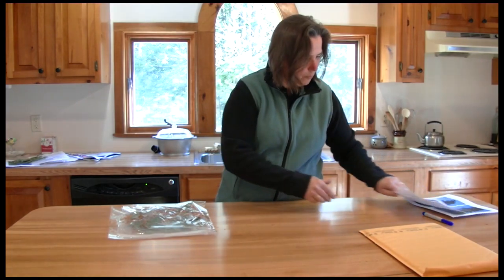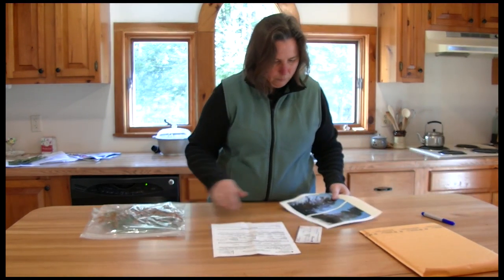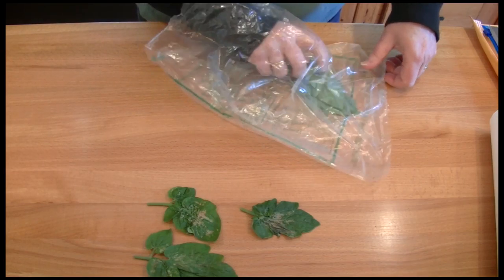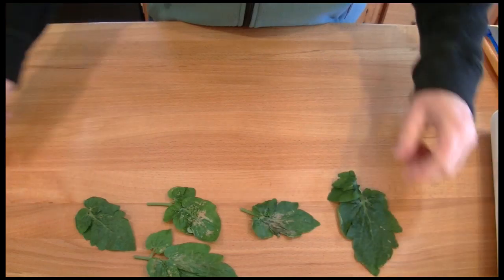When submitting samples to the Plant Diagnostic Lab, first collect your samples and have all the materials ready to package and ship the samples. Be sure to have a completed sample form ready as well. It's best to provide samples with a range of the symptoms and to include a healthy sample or portion of the plant, if possible.